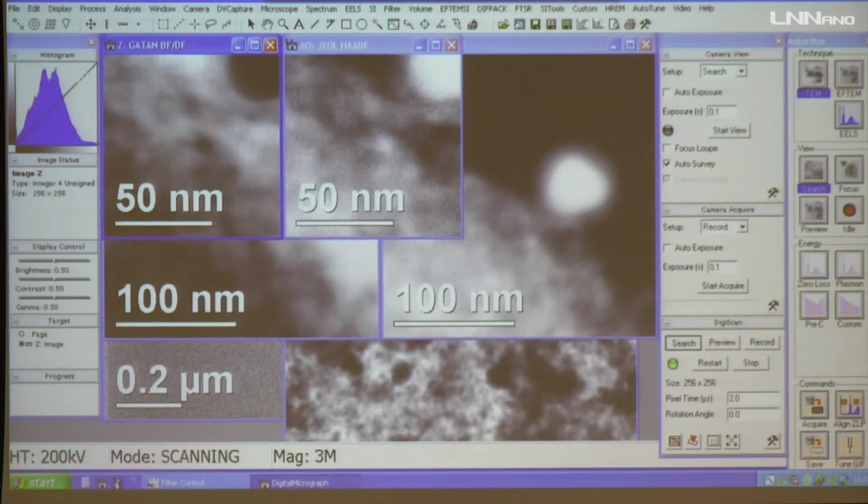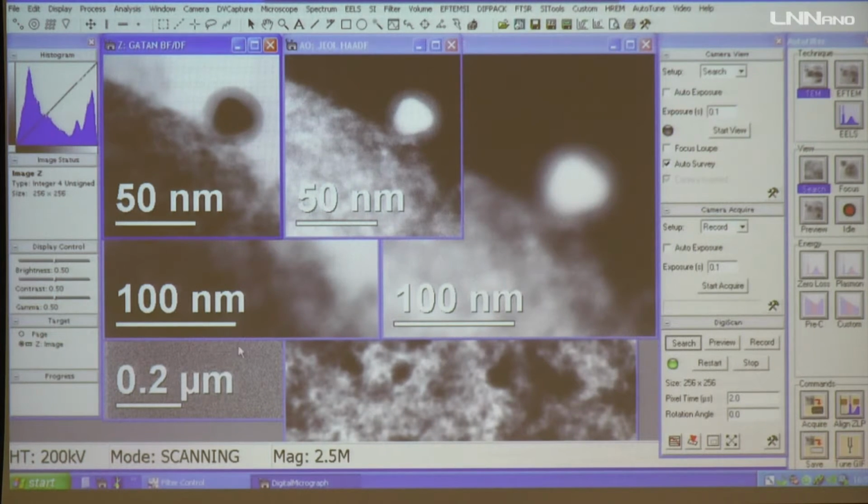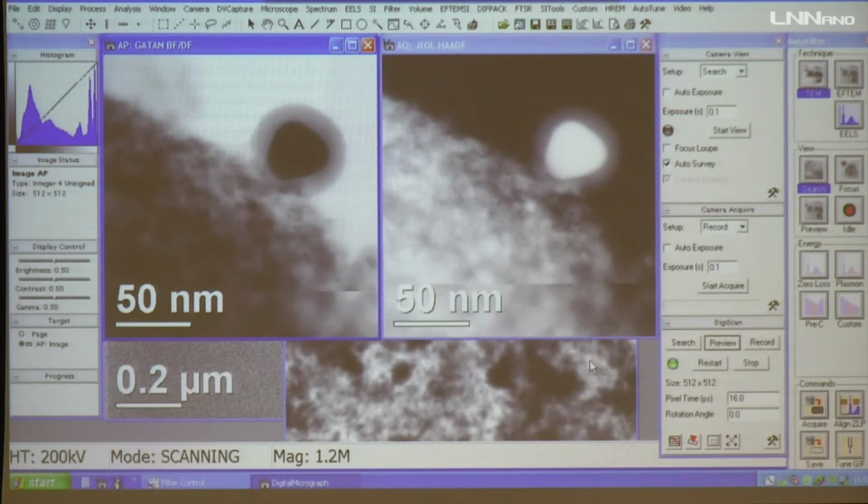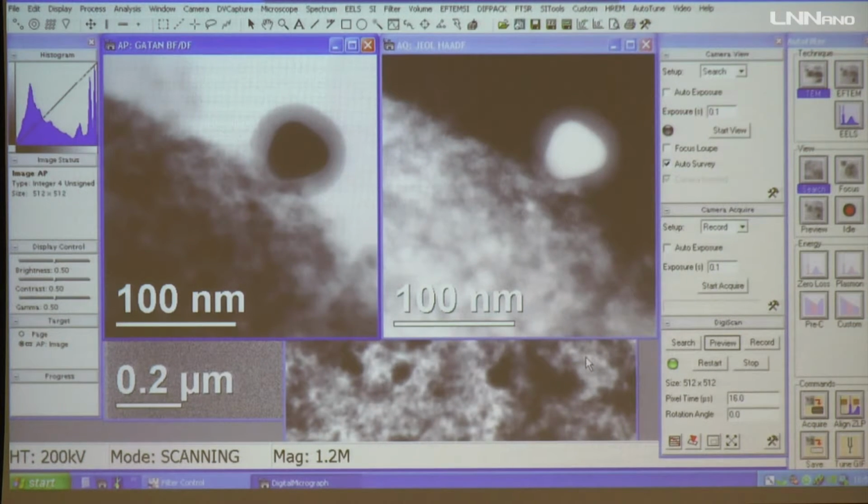Okay, we can see also if we are or not with residual astigmatism in the condenser. Okay, it looks like we do not have something because there's no distortion. I make something like here for the best focus. And then we can look in the preview mode. It's a very strange sample. Looks like an ET.